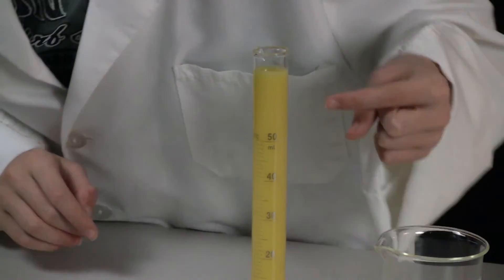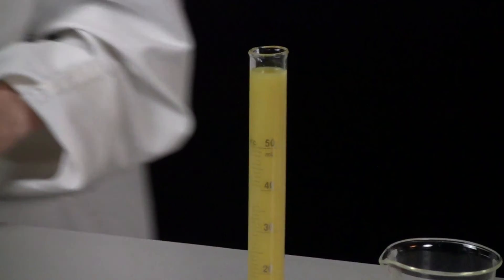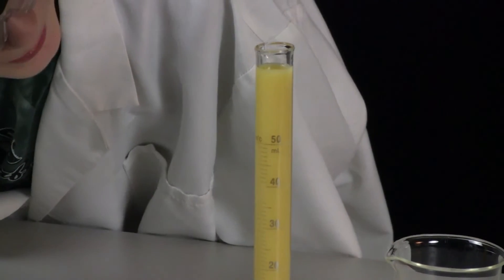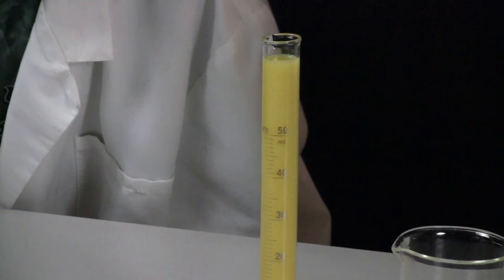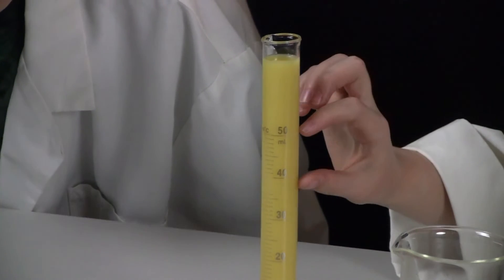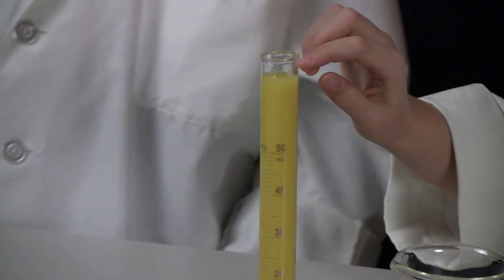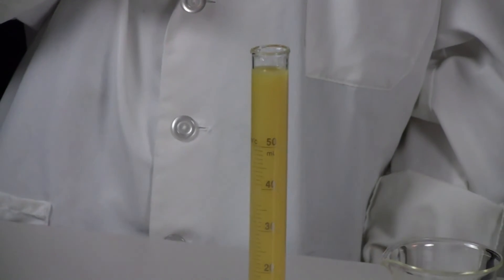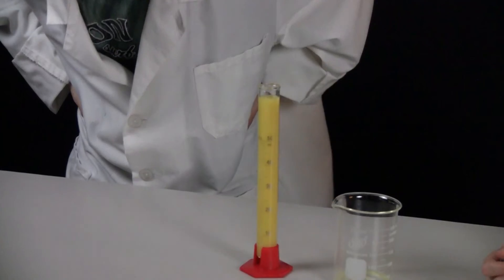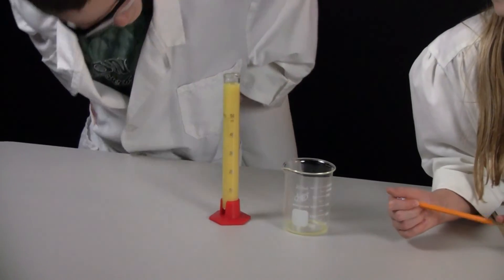You see how the 40, now where would the 60 be? It looks like it might be on the... It's exactly the same amount as the 40, so 60, and then a little bit more, so 75. So it started at 75, so we are thinking, hmm, I don't know, it looks a little bit less than 75.